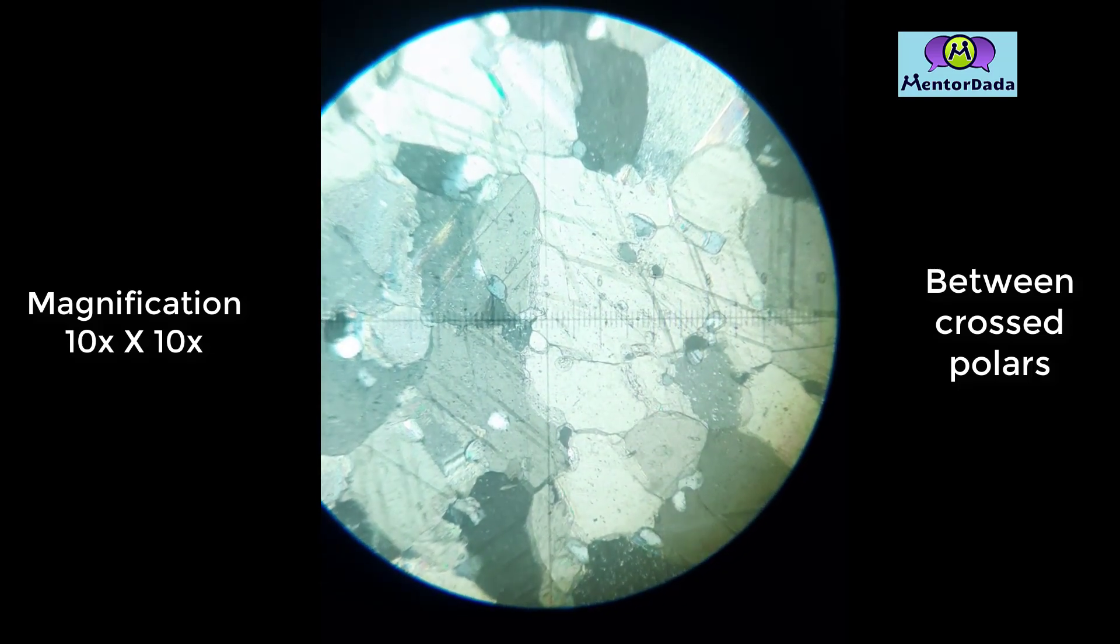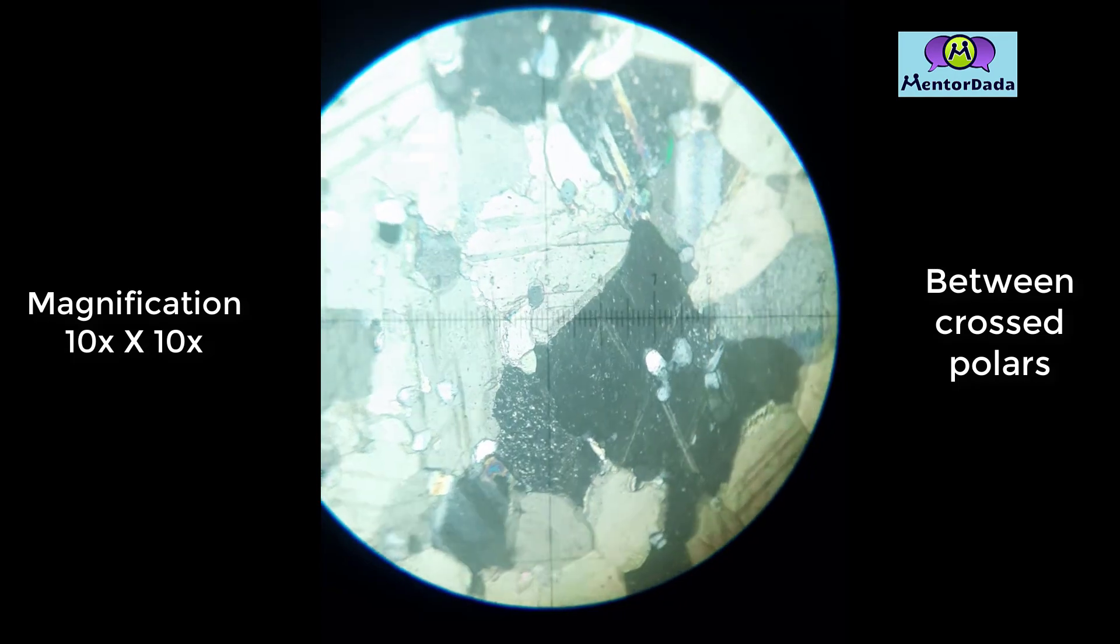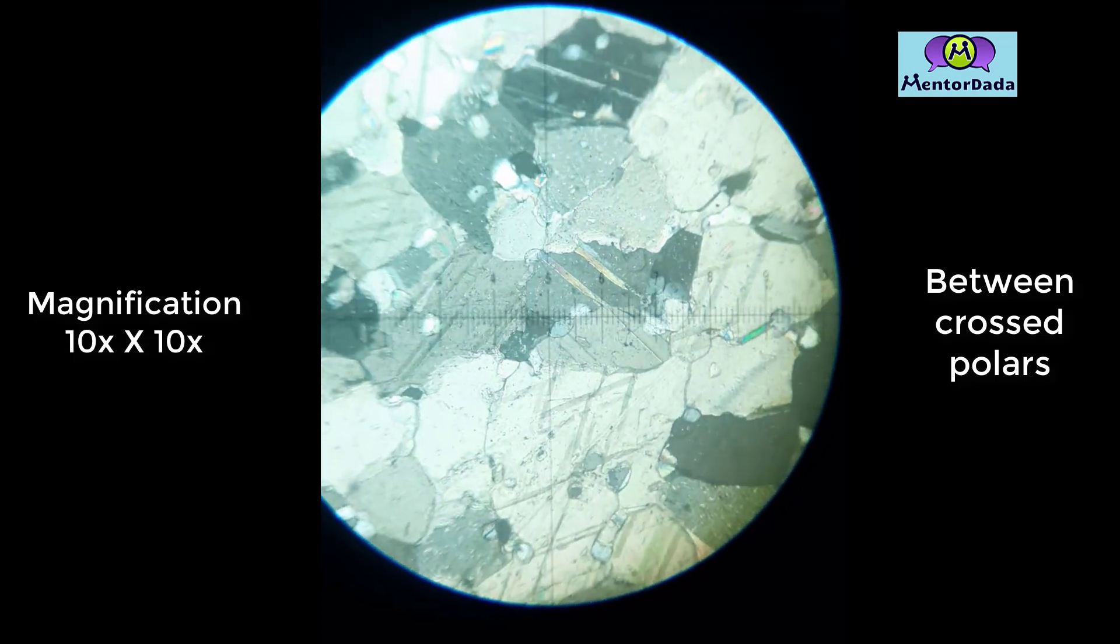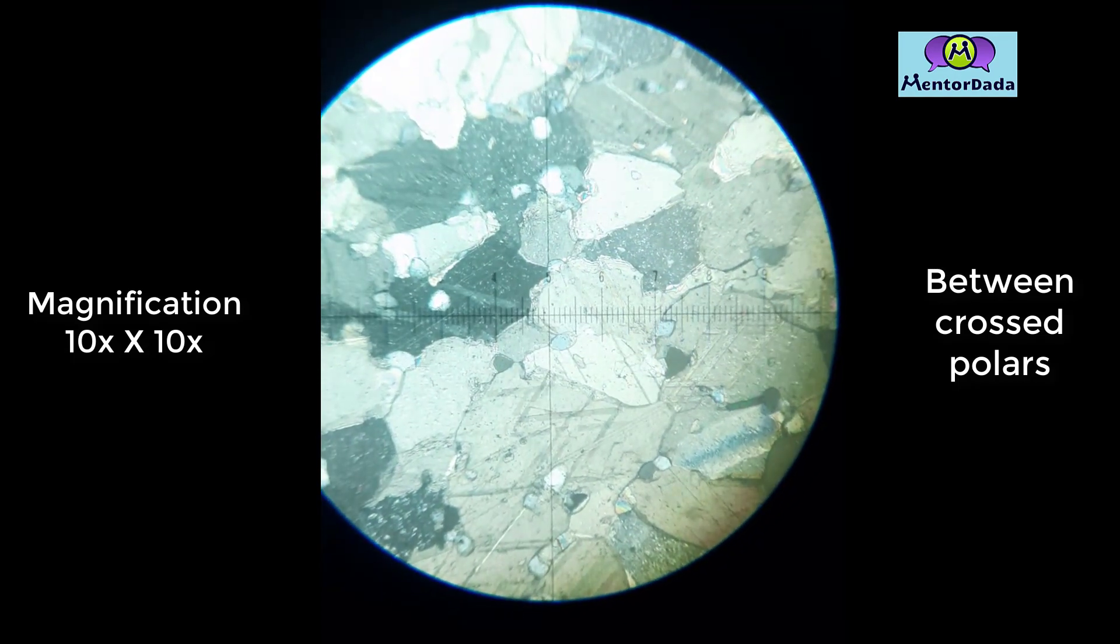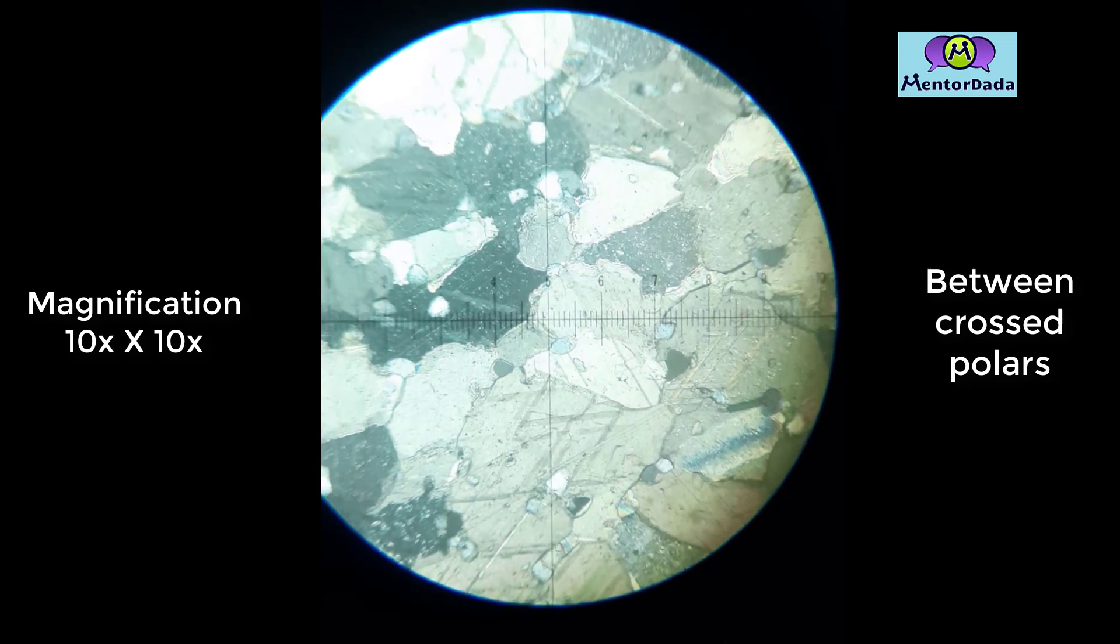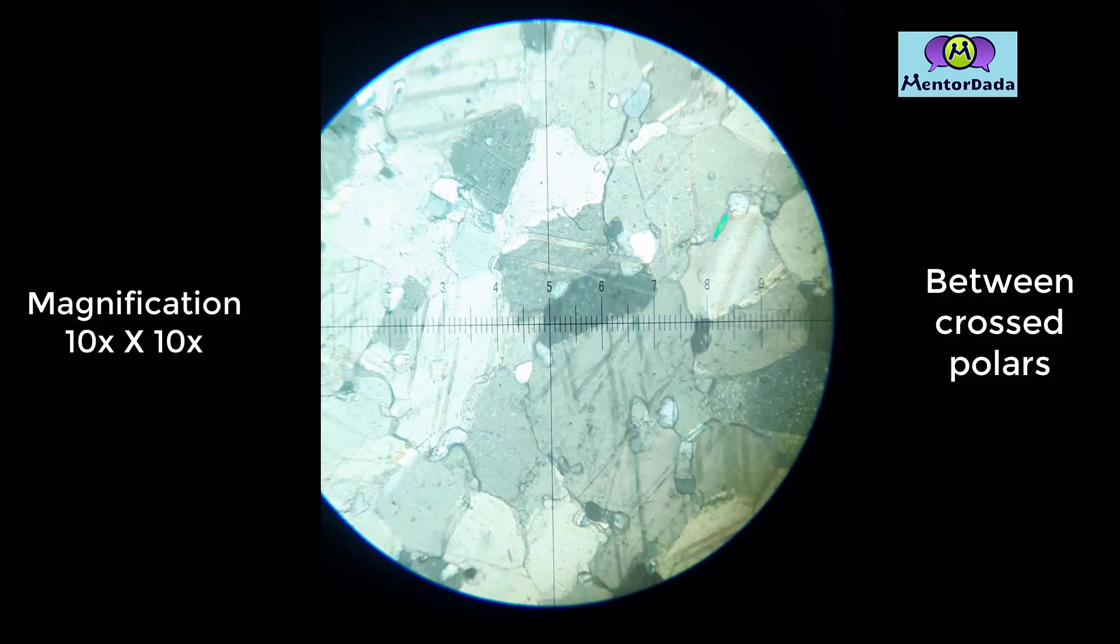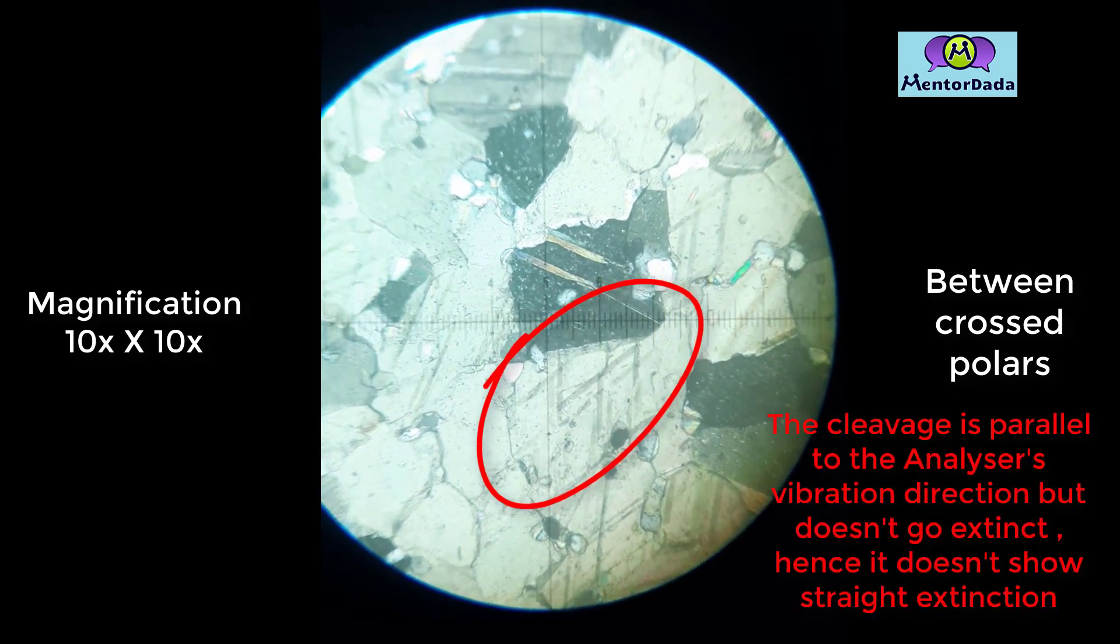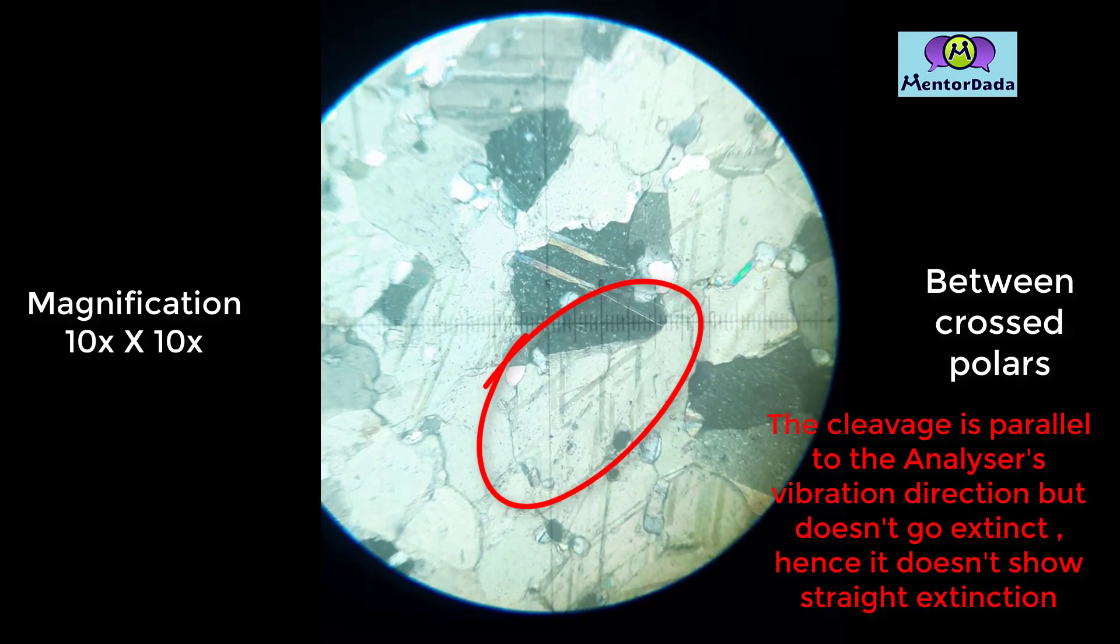The mineral shows inclined extinction because when we align one of its cleavages with any of the hairlines of the microscope, the mineral does not go to extinction.